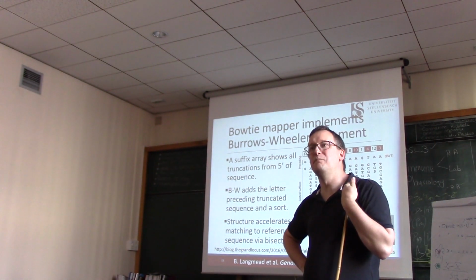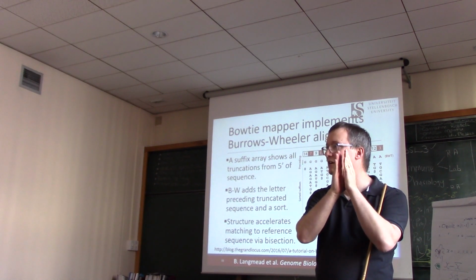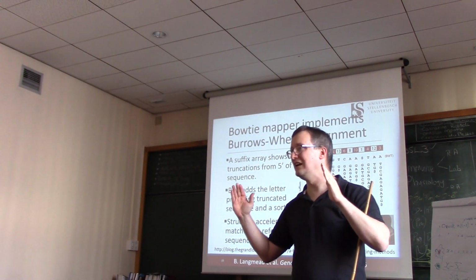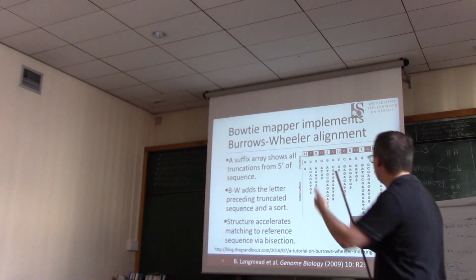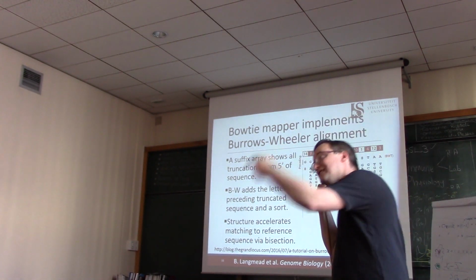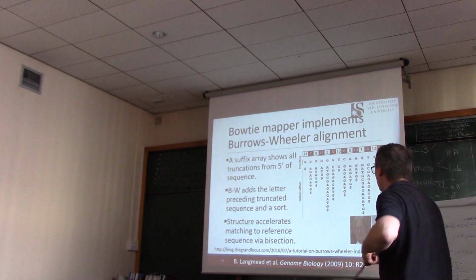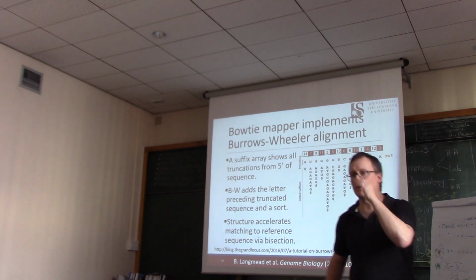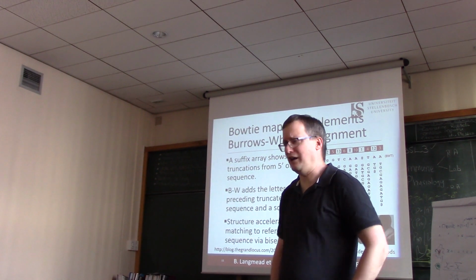So when you start with millions of sequencing reads, you can imagine that the software is considering the last nucleotide of each read, the last 2 nucleotides of each read, the last 3, the last 4, the last 5, and then sorting all of these together in order to find the best way to determine any intersection between sequencing reads that we produced and an annotation that we want to overlay them upon. Wild, huh? Okay, so this is an astonishing process, and I'm going to start with what my computer science algorithms teacher would have called brute force and ignorance, BFI algorithm.